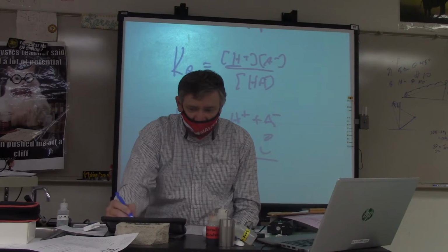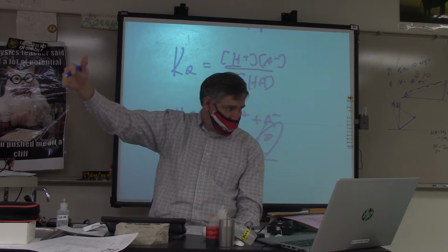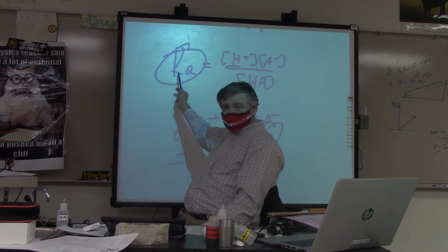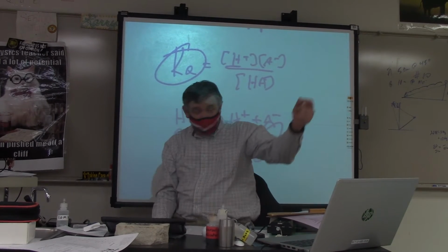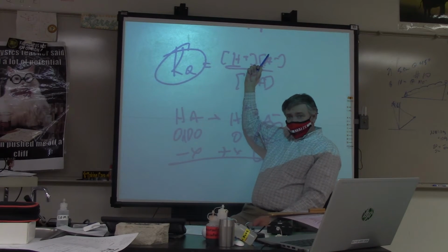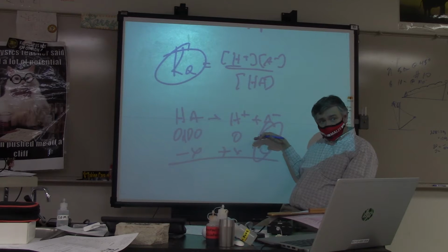Now what happens is that you're going to overload this with some anions, okay? So you're going to add some sodium acetate to it. Now here's the bigger picture that you have to get. Mother Nature still wants this exact same Ka value because that's when Mother Nature is in equilibrium, okay? That's the mindset of Mother Nature, to be in equilibrium. So what happens is that you increase the concentration of these anions, where these don't start at 0, okay? That's the big shift. This does not start at 0.